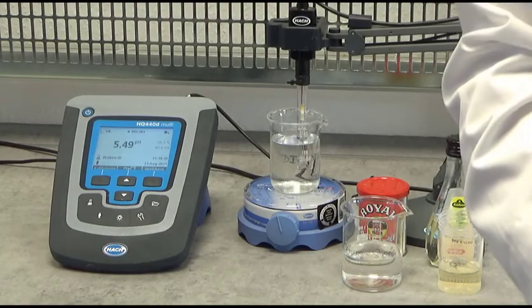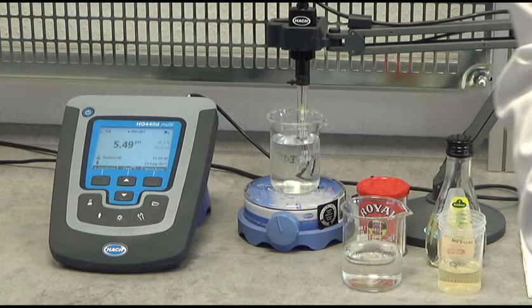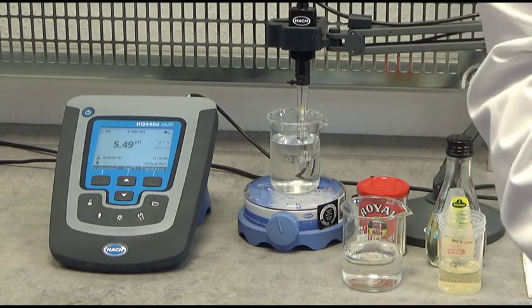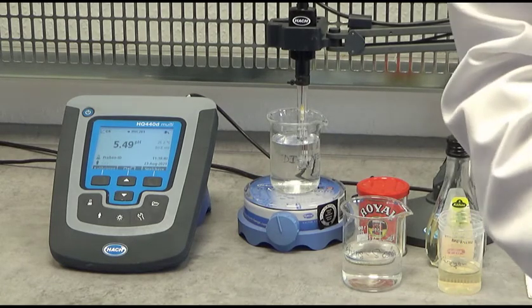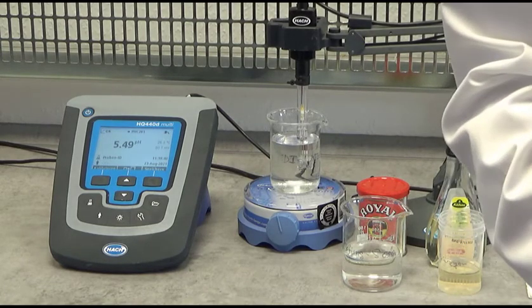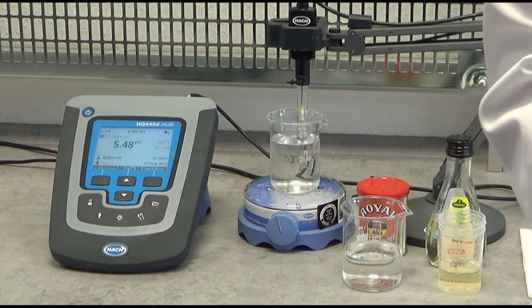In this short video, I would like to demonstrate what alkalinity is. A measurement of alkalinity in water can tell you how much acid or base can be absorbed without changing the pH of the water.